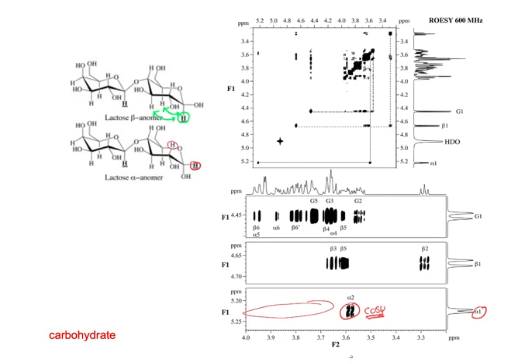So for beta 1, they see some to beta 3, so this is beta 3, and to beta 5, which would be the other axial position. Right? And then they see the COSY, the coupling to beta 2.